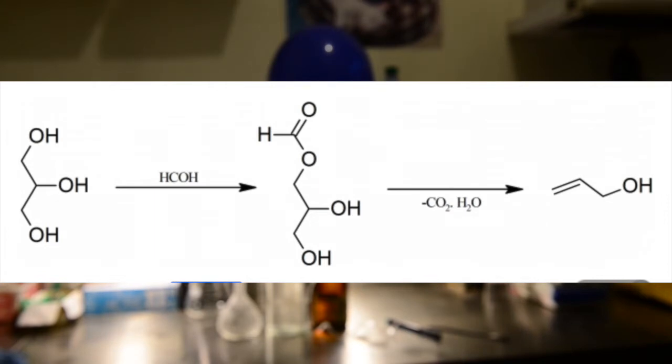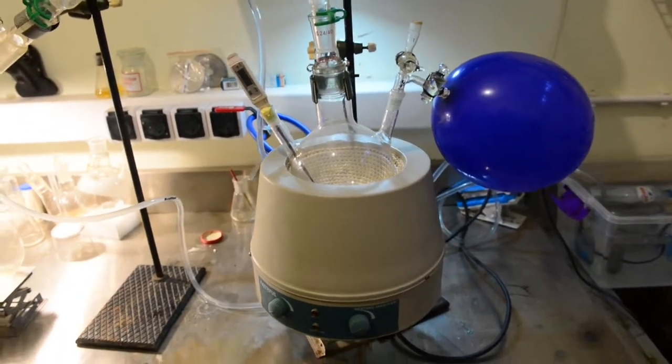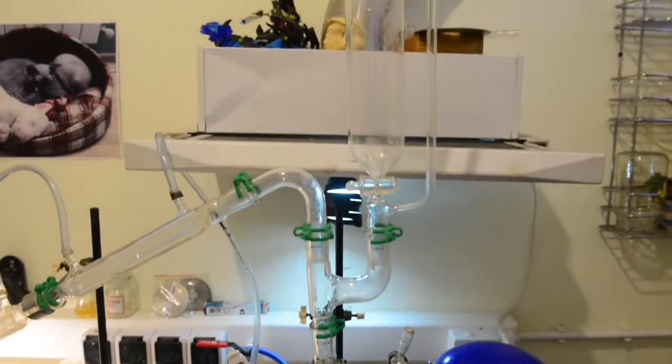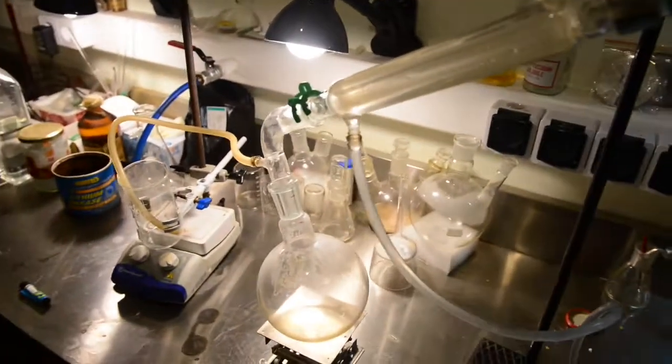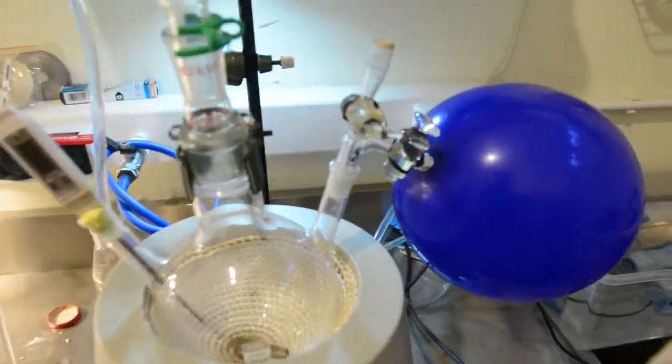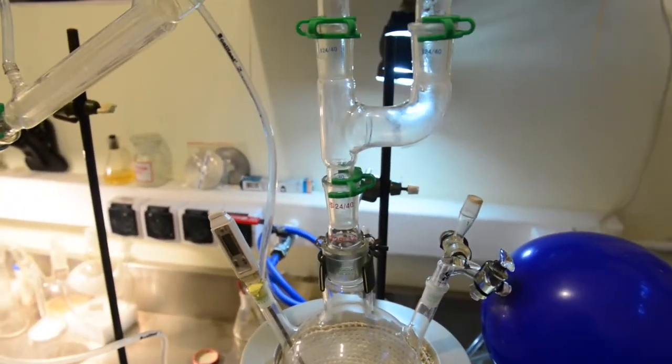For this reaction, we will need glycerin, formic acid, and potassium hydroxide trap to destroy toxic acrolein, which might be formed as a side product of this reaction. We also need a balloon connected to our apparatus, with which we displace atmospheric oxygen. It is possible to do it without a neutral atmosphere, but your yields will be miserable in this case.